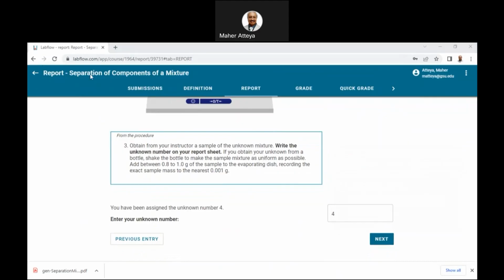Okay, so here it is. Enter the sample unknown number.